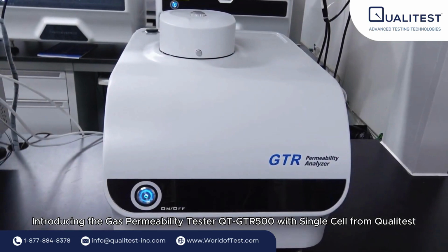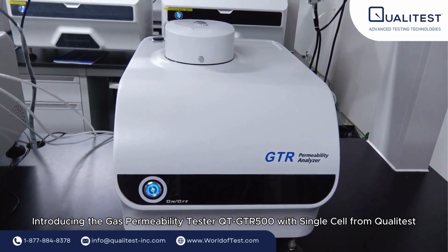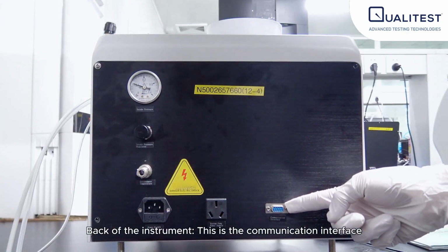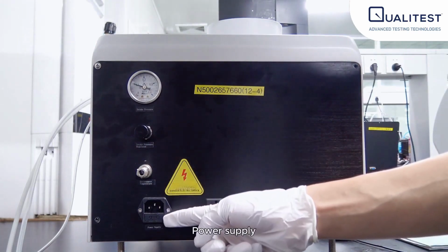Introducing the Gas Permeability Tester QT-GTR500 with single cell from Qualitest. This is the communication interface. Vacuum pump power supply. Power supply.